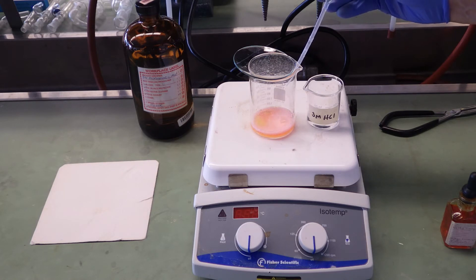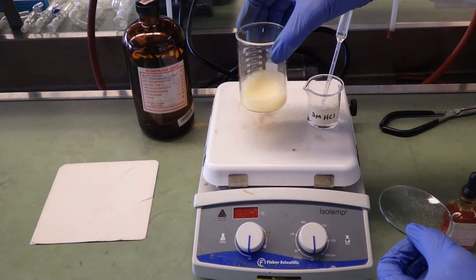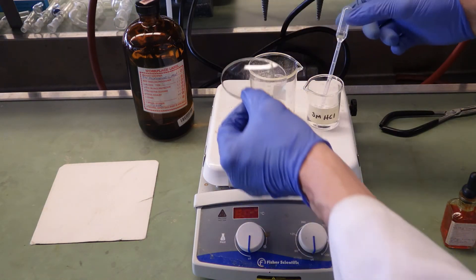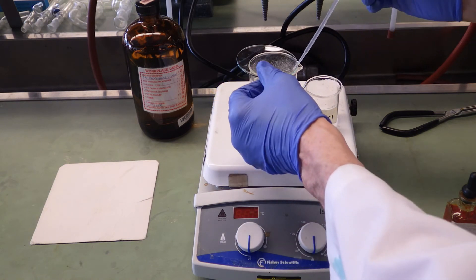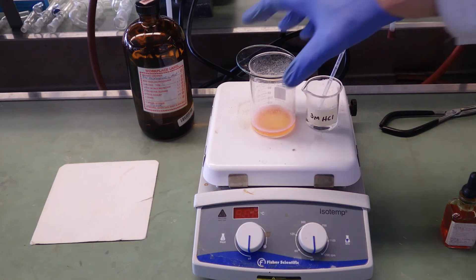And we see the localized red color formation as the acid hits the indicator. But when you mix it, the color reverts to yellow, indicating that sodium bicarbonate is still present in excess.